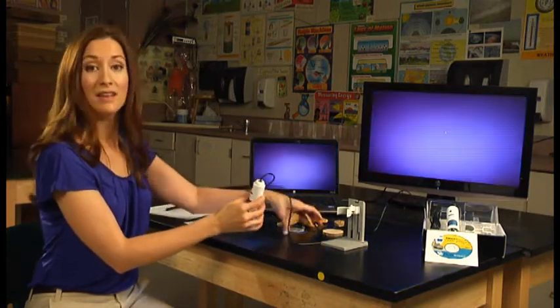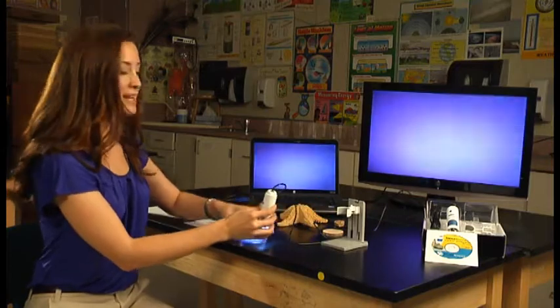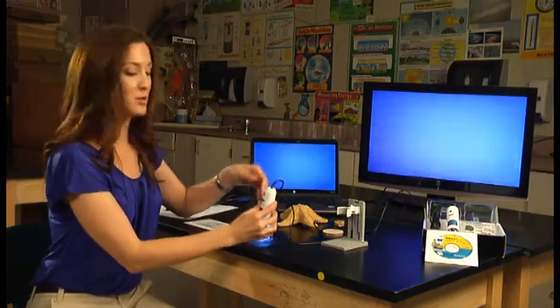And unlike a traditional microscope, you're not limited to just slides. You can really take a look at anything you've got in the classroom. Next, I wanted to show you traditional table salt.